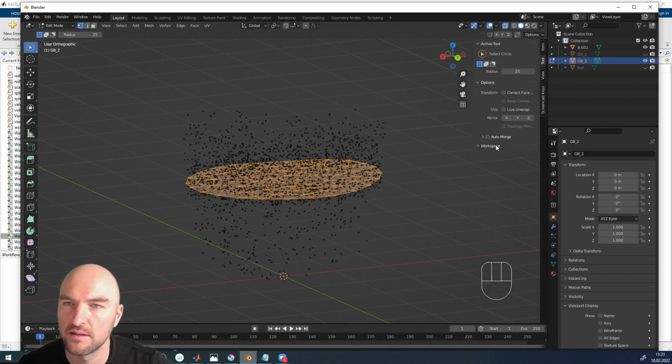Peter, one quick question. Do we have our changed grain boundary exported again to Blender right now? Because we only have the old first model grain boundary in Blender and not the grain boundary that we changed again in MATLAB. I saved that into the public folder where all the data from that grain boundary is, so Martin can email it out to everyone. It's a very small file, so that should work pretty quickly.